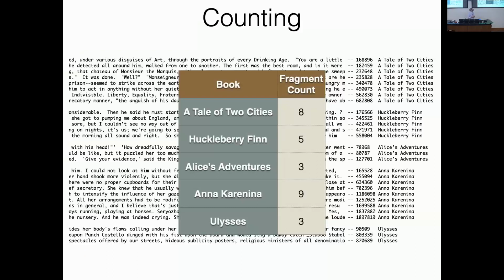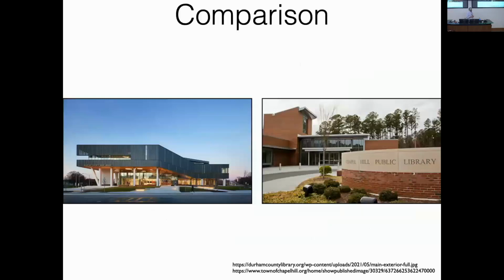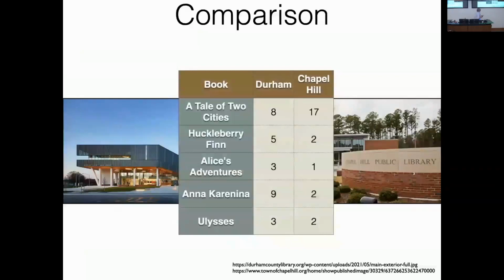because really our main focus for differential gene expression, and I'll say that for today, is comparison. If we have data from Durham and data from Chapel Hill, we can look and say, okay, it looks like we have about 4 times as much Anna Karenina in Durham as we do in Chapel Hill. Now, there are some statistical issues with that just because the numbers are small and we don't have replicate samples or anything.